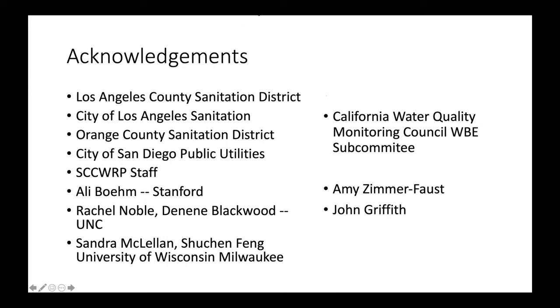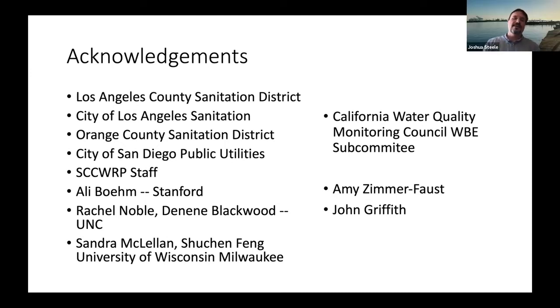I might be a little out of order, maybe just to string the story in a way. Most of the questions surround the use of wastewater. So the question is, why just wastewater and not drinking water? And then questions about stability, about RNA in wastewater and any kind of PCR inhibitors that might be there. Okay, those are great questions.